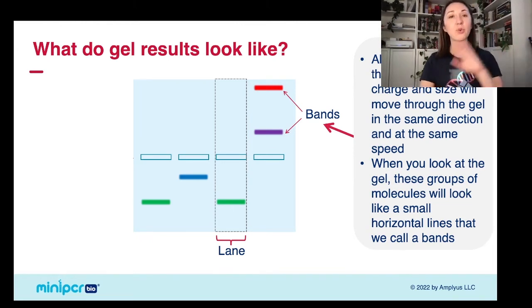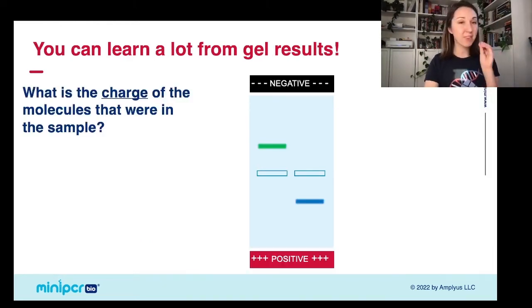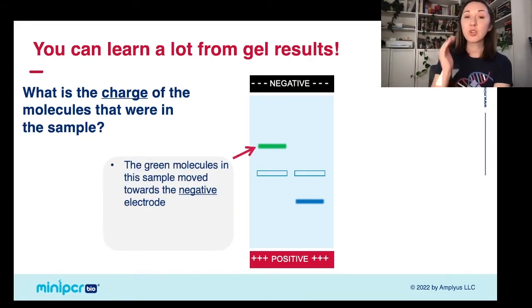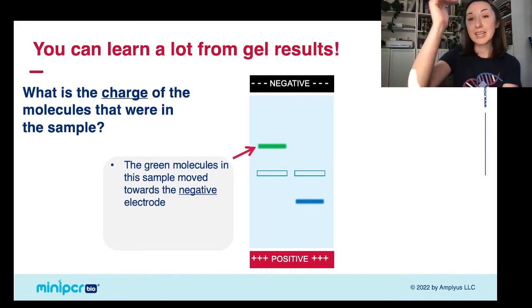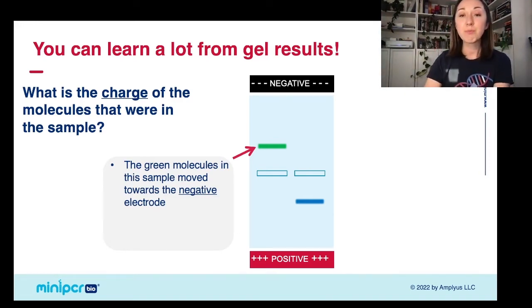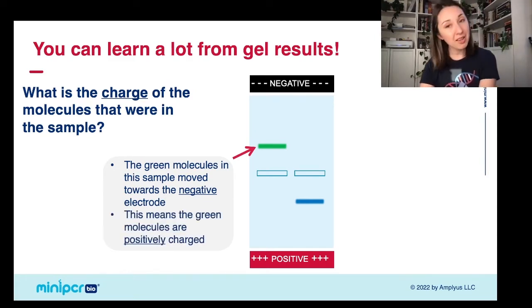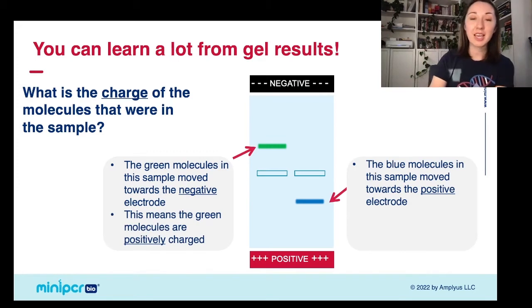So we're going to walk through this again really slowly. First thing we're going to look at is we're going to be able to tell the charge of molecules in a sample based on how they moved. So here in a sample, we can see that the green molecules moved towards the negative electrode and the blue molecules moved towards the positive electrode. So the green molecules move towards the negative electrode, and that means that they are positively charged. And the blue molecules move towards the positive electrode, so that means that they are negatively charged.